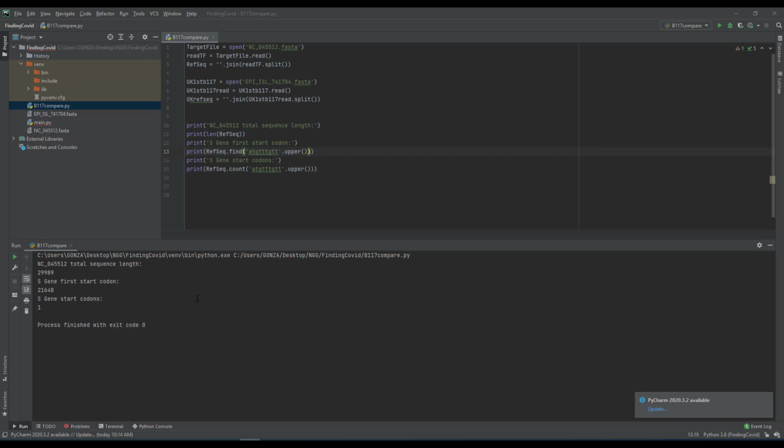Okay, so I gotta rush this video out here. I wanted to get it out about last week with the lecture 1 to follow up that coding, because this is where I left off, except I had some weird names in and I corrected it to make sure that people can follow along.